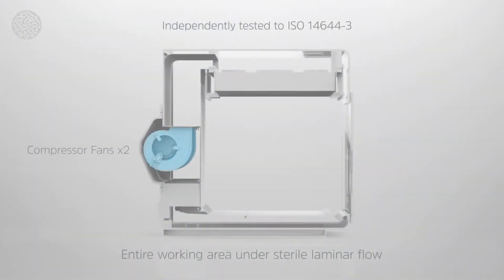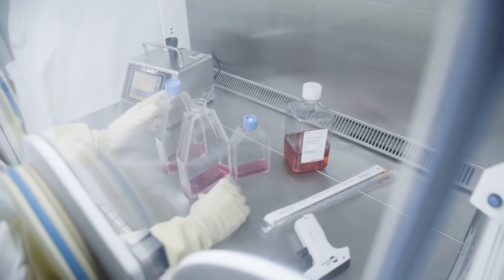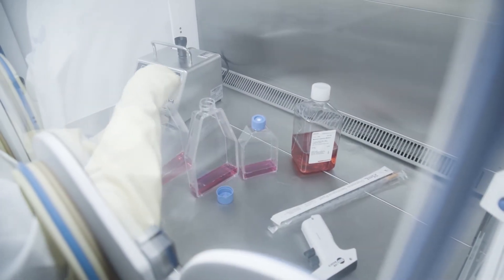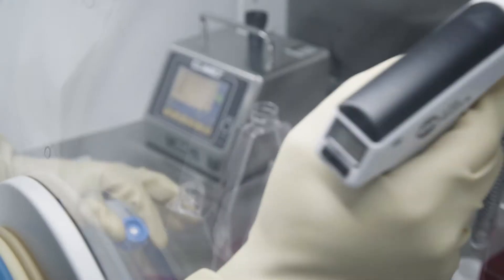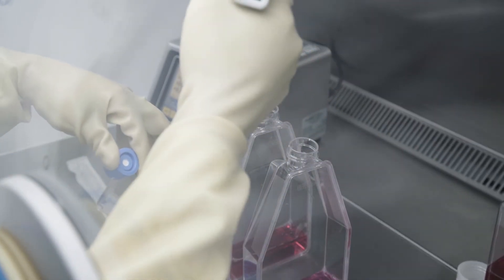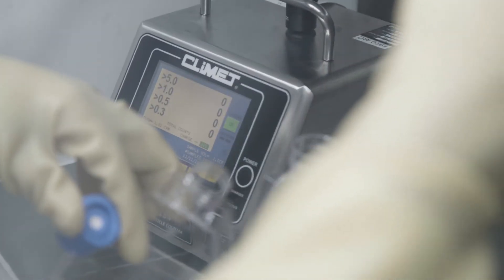Laminar airflow is mapped to ensure air velocity is homogeneous and within the speeds for Grade A zones set out in Annex 1 of the EU Guidelines to Good Manufacturing Practice for Medicinal Products. Combining laminar airflow with a choice of either an H14 HEPA filter or a U15 ULPA filter ensures particle counts remain below those required for Grade A working environments, both at rest and in operation.